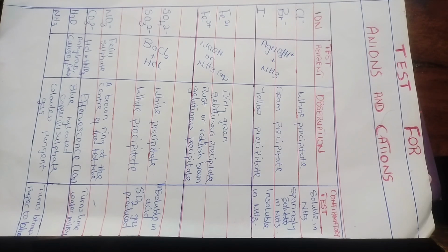So if you are carrying out an experiment or you are answering a question and you see sodium hydroxide or ammonia as the test reagent, what should be at the back of your mind is that they are testing for the iron 2 ion or the iron 3 ion. Now the observation will tell you which of the ions is present in the test sample.